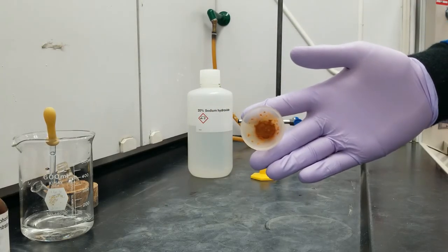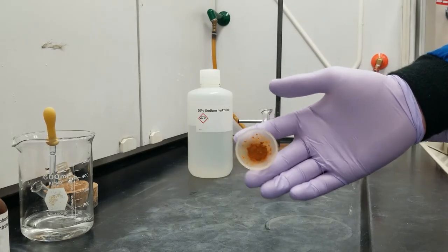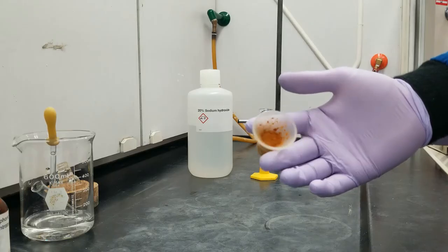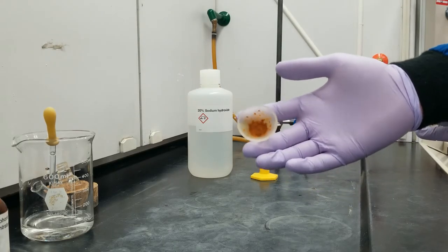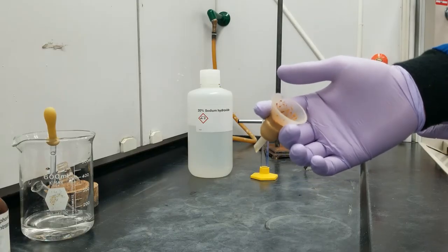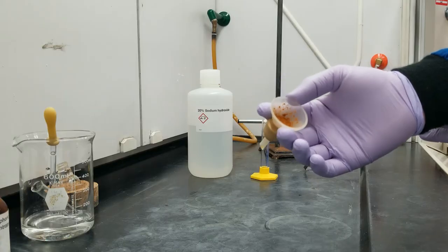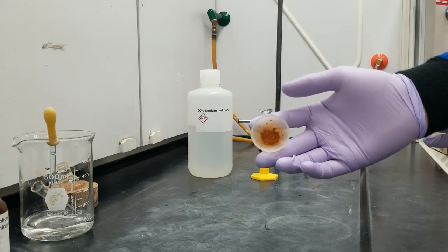Acetyl ferrocene and ferrocene looks like a really nice orange mud. I'm going to continue to dry this for a few minutes. We've already let it dry probably for 5 to 10 minutes. It's been incredibly painful and long, and we're going to do this a little bit more in a cut so that we can start working on the column chromatography setup as well. So we'll come back to that.